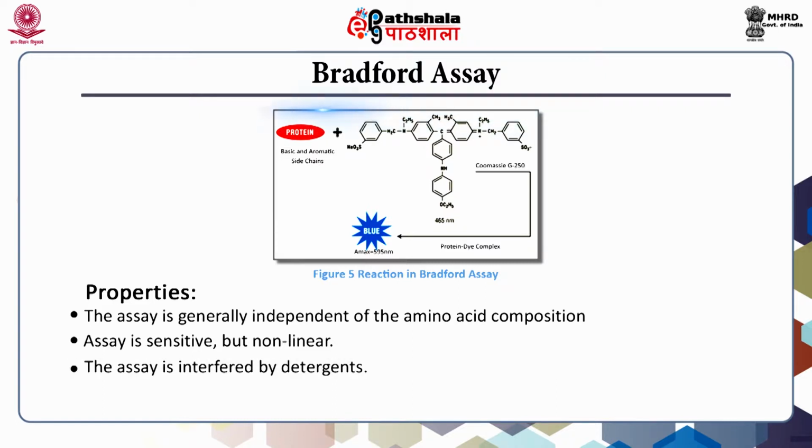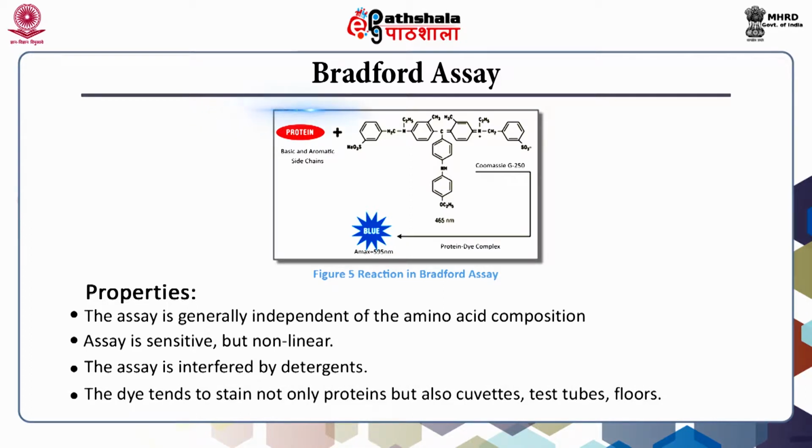This assay is also interfered with by the presence of detergents like SDS. Careful handling is very important because the dye stains not only the protein but also the cuvette, test tube, floor, etc. It must be taken care of that the cuvette and test tube stain can be removed by washing with ethanol.